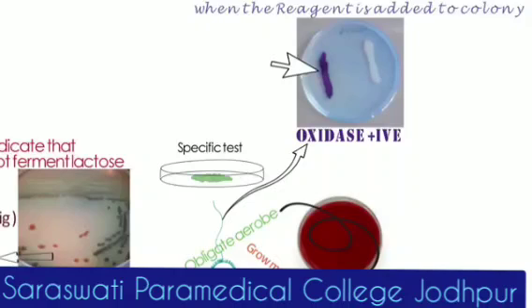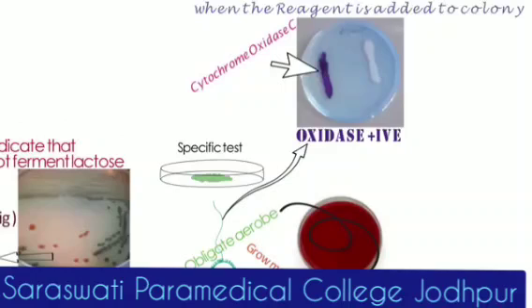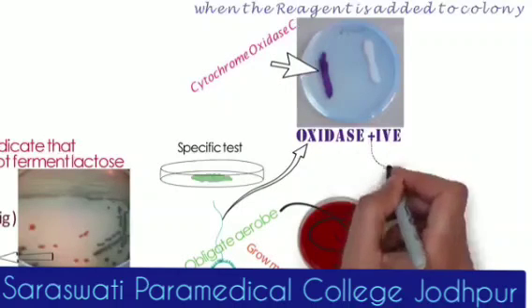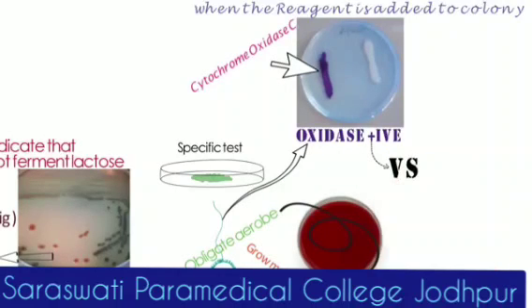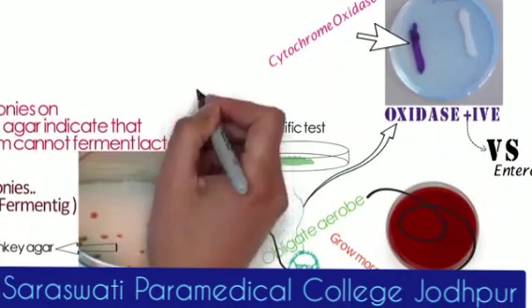They oxidize glucose because they have a cytochrome oxidase C. And the bacteria which do not oxidize and do the fermentation of the glucose do not have cytochrome oxidase C. So this dark oxidized product is a result of cytochrome oxidase C. This test differentiates Pseudomonas from other oxidase negative gram-negative rods.